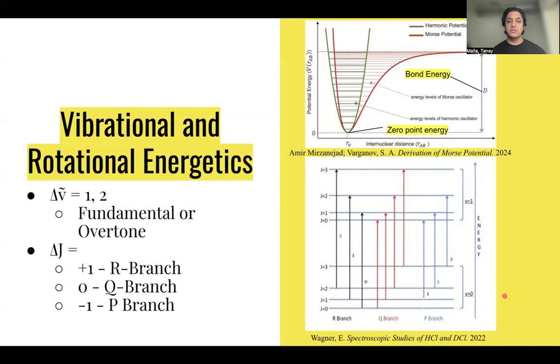Rotational transitions, as opposed to vibrational, are much weaker, only resulting in transitions of approximately 20 wave numbers. These rotational transitions only change by plus or minus 1. Because of the small transition, we need to have very highly accurate IR readings to be able to witness these peaks.